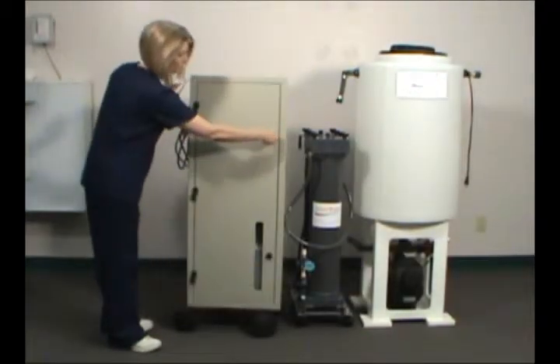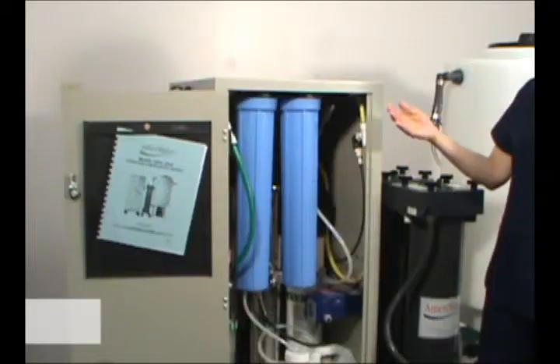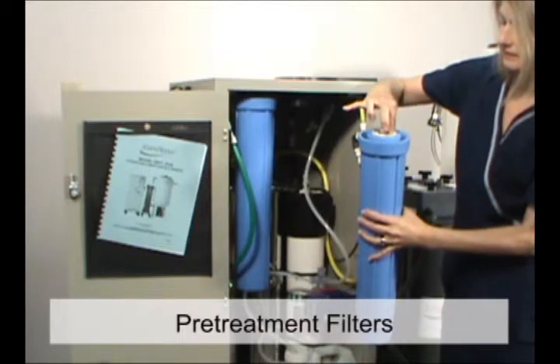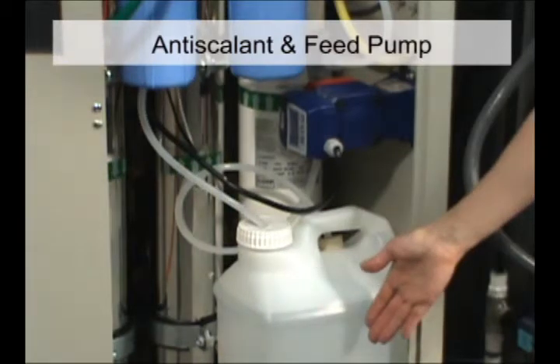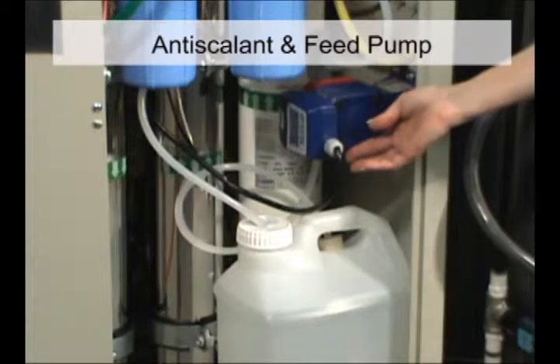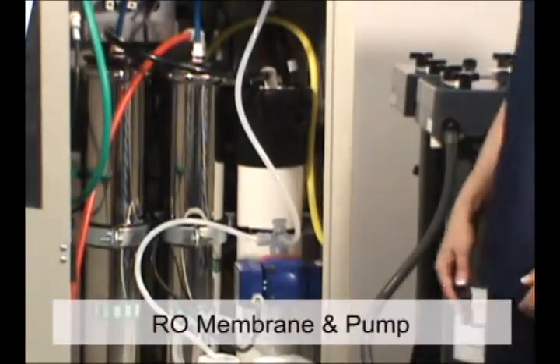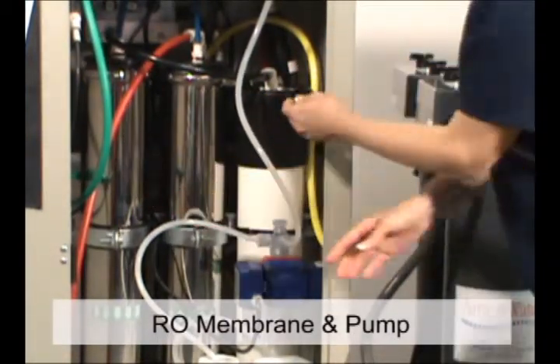The reverse osmosis unit is made up of three major components. The first is the pre-treatment filters that remove sediment and chlorine. The second is the anti-scalant chemical storage container and feed pump, which supplies anti-scalant into the feed of the membranes, combining with water hardness minerals to prevent scaling. The third is the RO membrane and pump, which squeeze good water out of tap water.